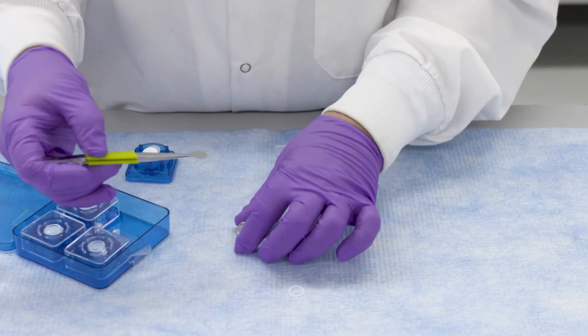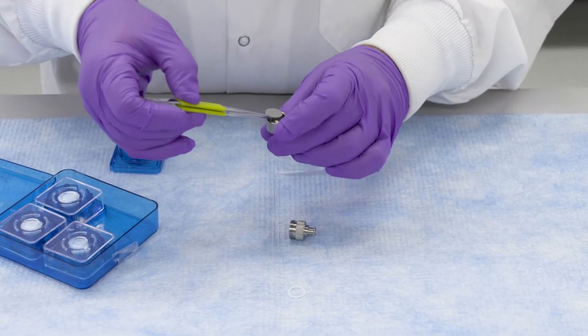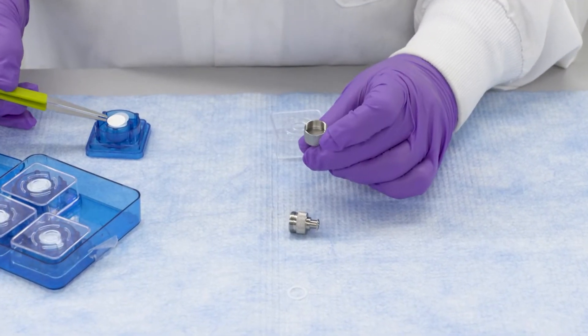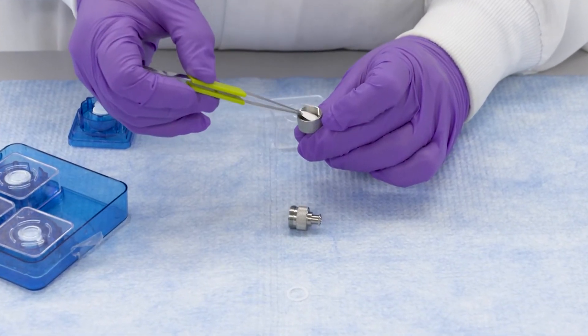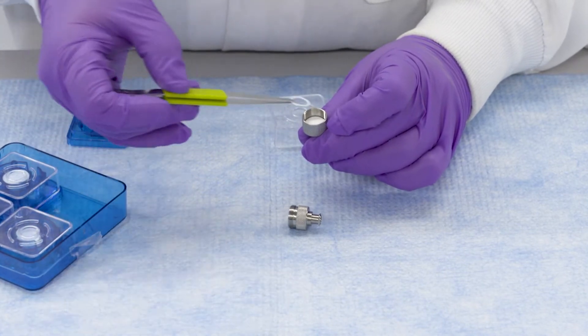The SWINI filter holder allows you to make your own syringe filter for small volume filtration, giving you the flexibility to select the membrane that is most appropriate for your applications.